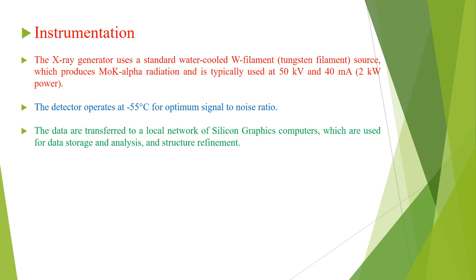The data are transferred to the local network of Silicon Graphics computers, which are used for data storage and analysis and also for structure refinement.